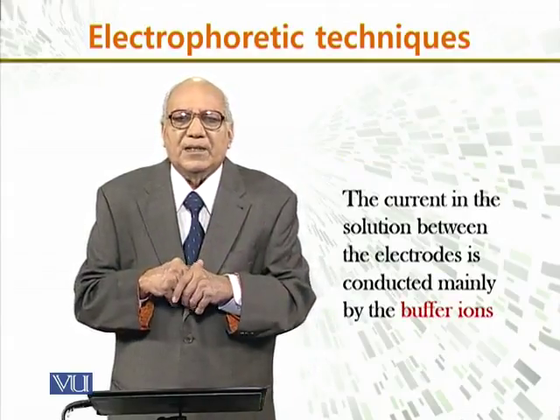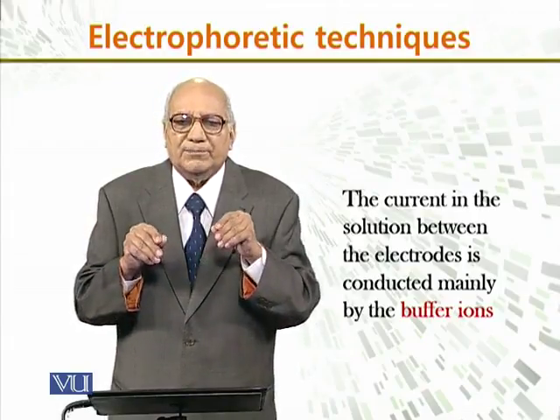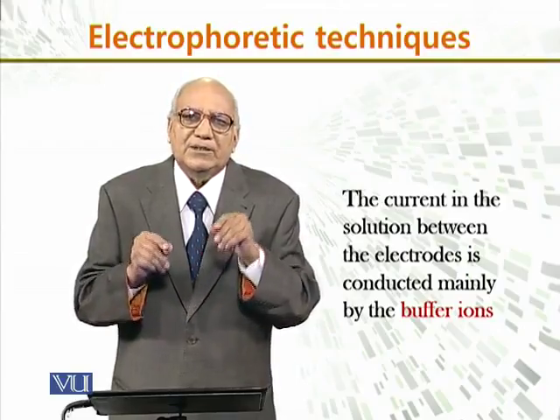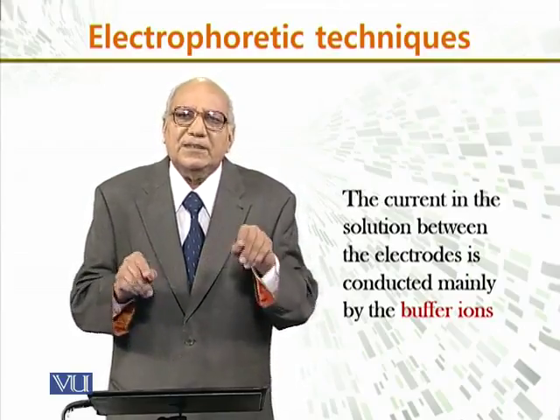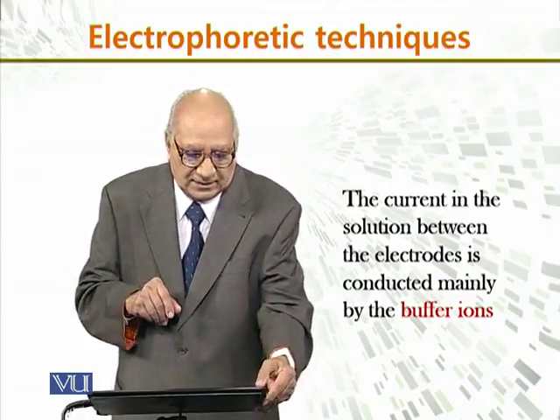The current in solution between the electrodes is conducted mainly by the buffer ions.